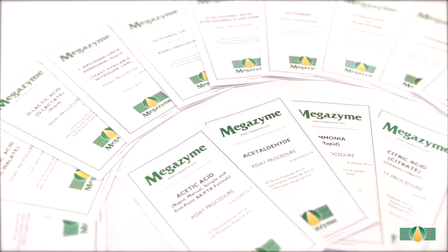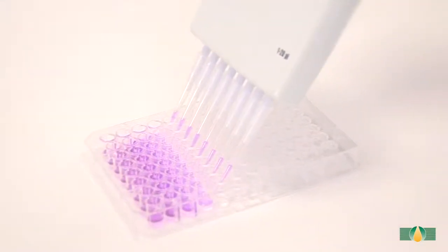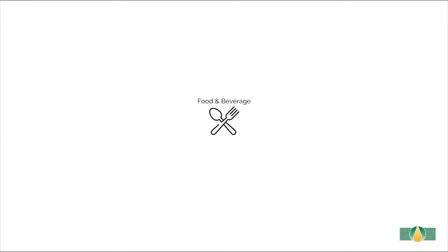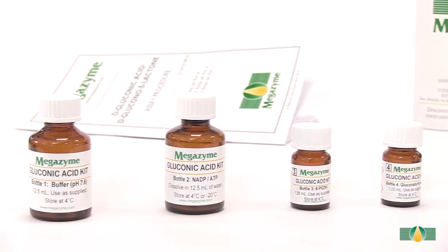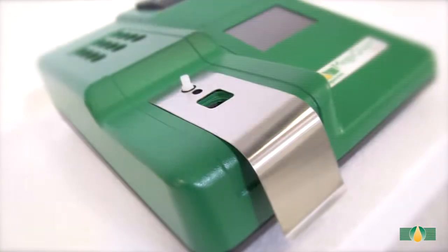Megazyme provides an extensive range of assay kits for use in various assay formats including auto analyzer, microplate, and manual spectrophotometer. This D-gluconic acid assay kit can be used to accurately measure D-gluconic acid in various sample types throughout industries such as food and beverages. This video tutorial will demonstrate the use of the assay kit with a wine sample using the manual spectrophotometer format.